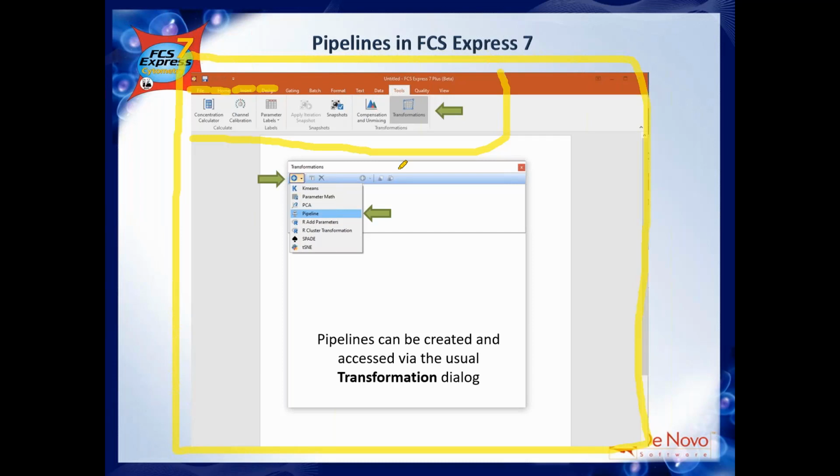If you want to make the picture bigger, that's fine. You can do that. So in FCS Express it is the same. If you want to start with a title, you will create the title, and then you will create one plot or maybe 3 plots in a row, and maybe a big histogram. That's fine. You are putting together the final results as it will be a PowerPoint presentation. But of course, it's much more powerful because everything is live updating, as you will see in a while.